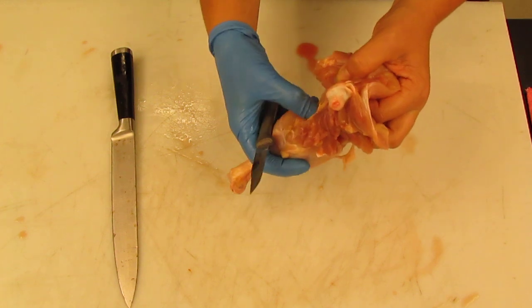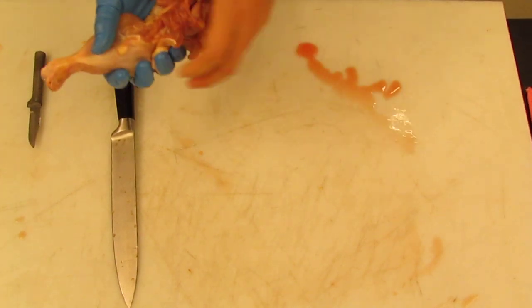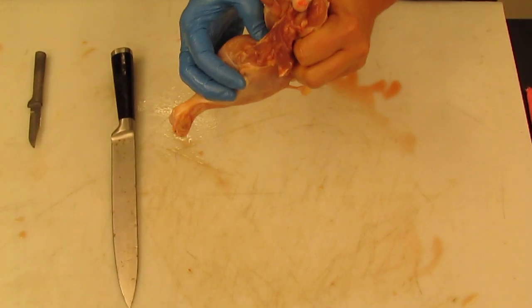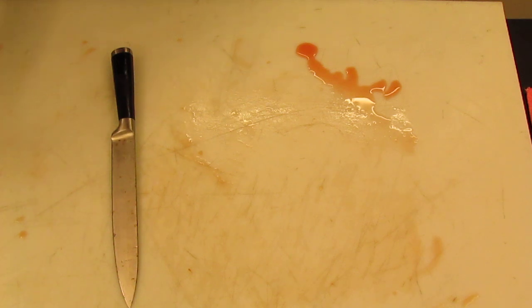Okay. Also, while I'm here, I have found another tendon. This happens to be the tendon, one of the tendons of the gastrocnemius. It's a little slippery, as you might imagine. All right, so here, this is the white structure. We can see that it is continuous with the muscle, and it just gets white and shiny at the end as it connects to the bone. Okay, and again, blood vessels and nerves.